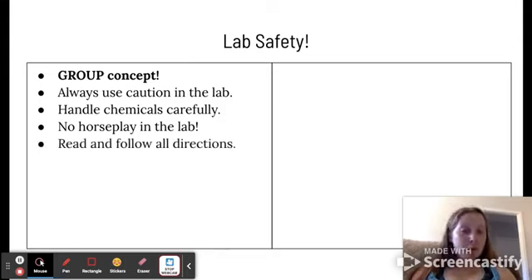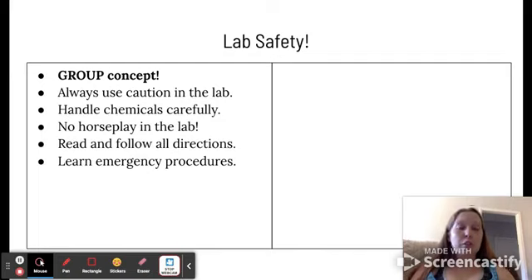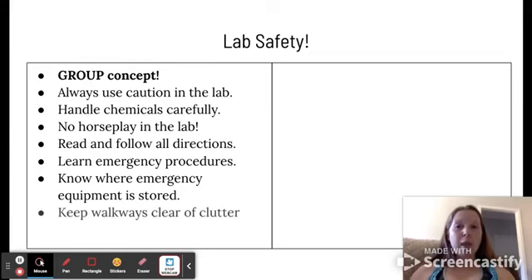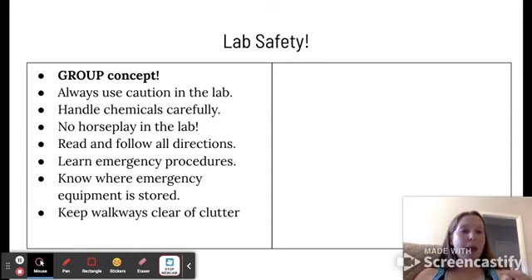Make sure you read and follow all directions. Learn your emergency procedures, which we will go over together in class. And know where all of your emergency equipment is stored, where the fire extinguishers are, where the fire blanket is, safety showers, things like that. Just make sure you know where all of that is located. And then make sure to keep your walkways in the lab clear of clutter. So like no book bags, cords, things like that. Just make sure it's easy to get in and out of the lab.